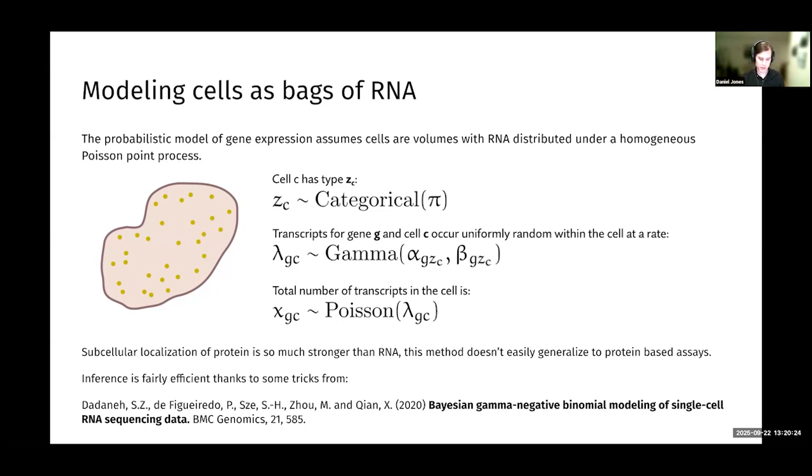Basically, if the cell has a boundary where it looks like a uniform spatial distribution of the same composition of genes, that tends to score highly. Whereas if you have something like a non-uniform mixture of genes, that tends to score poorly.